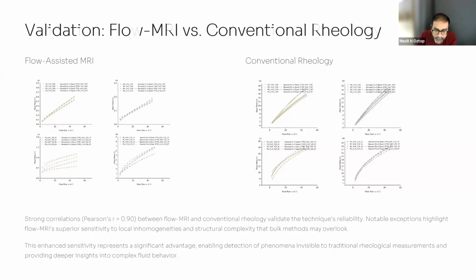In the literature, as I said, there are flow rheometers and there are even dedicated MR-based flow MR systems as well. I remember one company was producing that. But here the important point is the system should let you change the sample so that you will be monitoring the changes in the rheological properties of your sample.